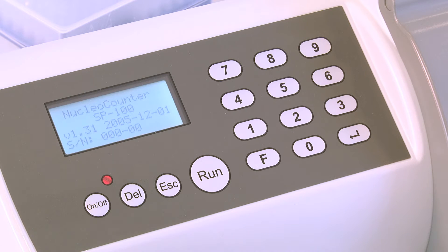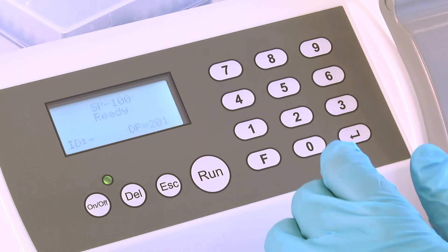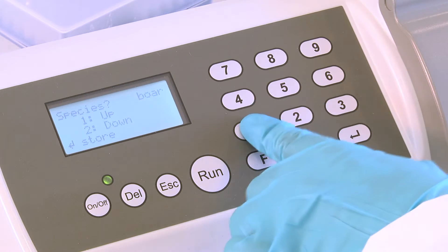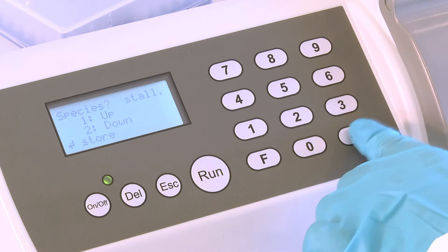Start the Nuclear Counter by pressing ON-OFF. The Nuclear Counter is delivered pre-set with the boar setting. Before using the instrument for stallion semen the first time, change the species to stallion. Press F11. Select stallion by pressing 1 up or 2 down until the display reads stallion. Store the new setting by pressing ENTER.